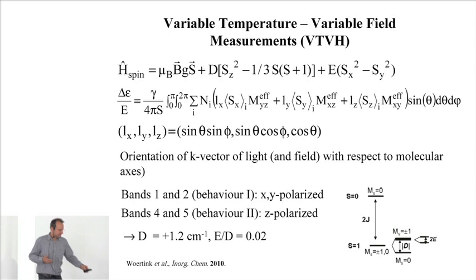Okay, so with these remarks, I wanted to finish my talk. I hope I was able to show you that one can gain a lot of information about the electronic ground state and the electronic excited states by optical absorption spectroscopy. You have to know what is behind these parameters: intensity, position, band shape. You have to recognize the progression. You have to know how to evaluate that progression. So there's a lot of information behind the seemingly simple technique. And I was able to show this to you.